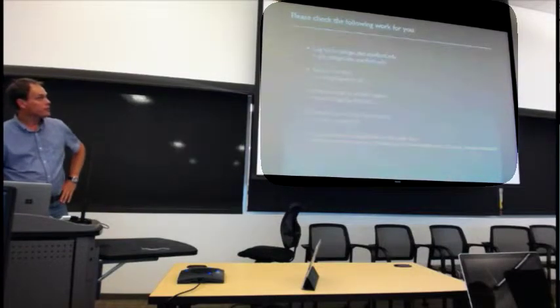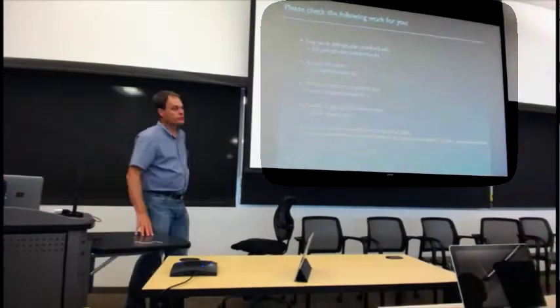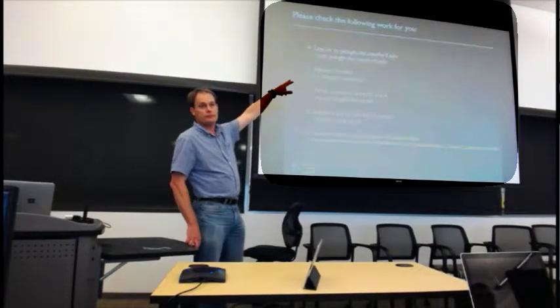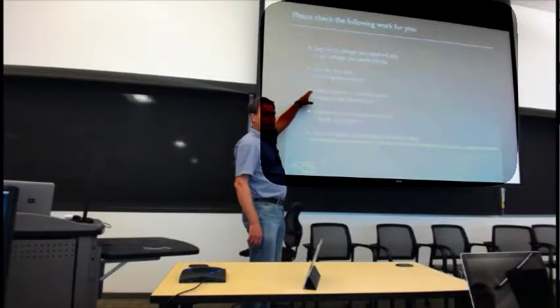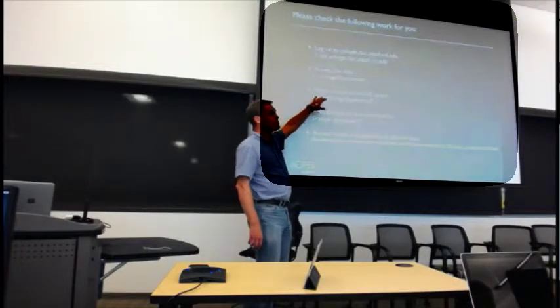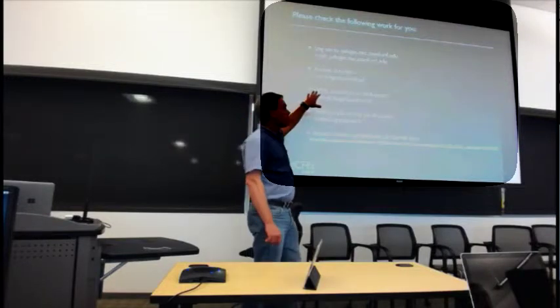So I think after Chris's talk, most of you have probably sorted out these sides of things. You need to be able to log into SLAC, okay? You need to be able to get to the experiment data, and most of you should probably have checked that this works already. You need to be able to work in the scratch space. All of this is associated with the permissions for the experiment that hopefully have been managed nicely.